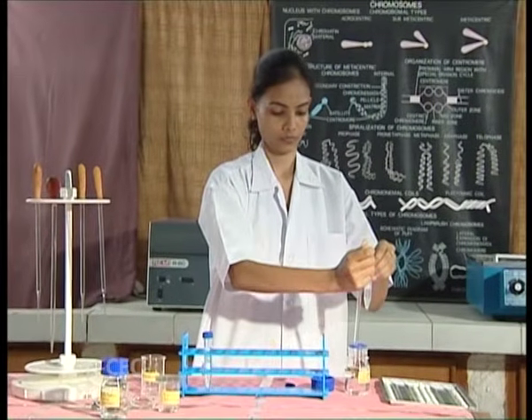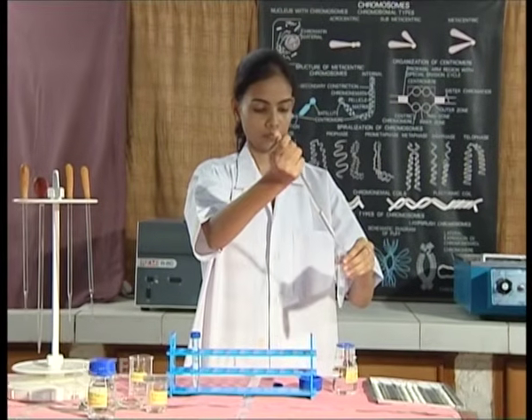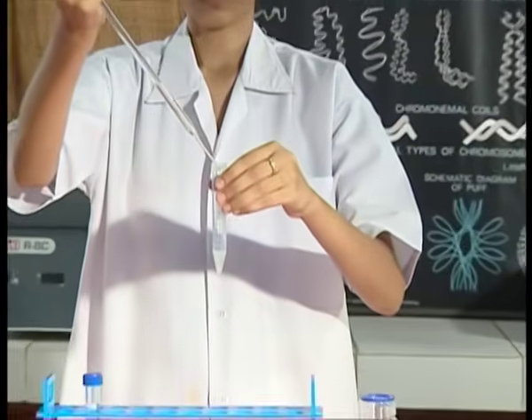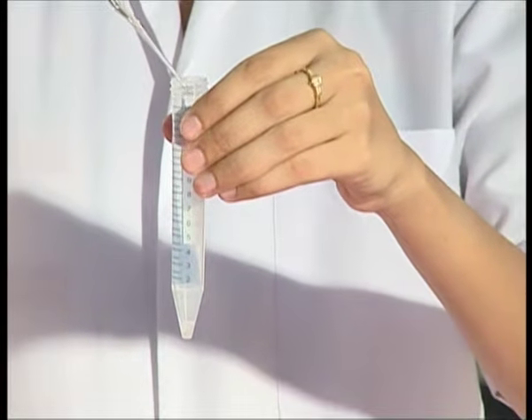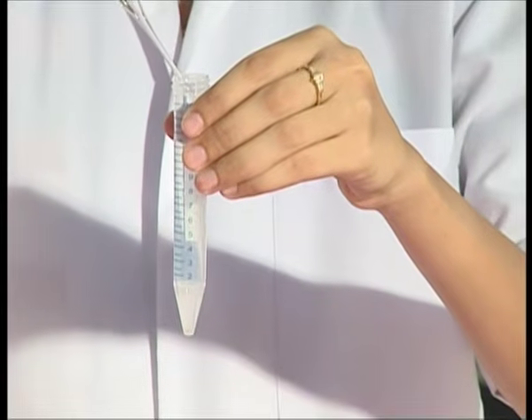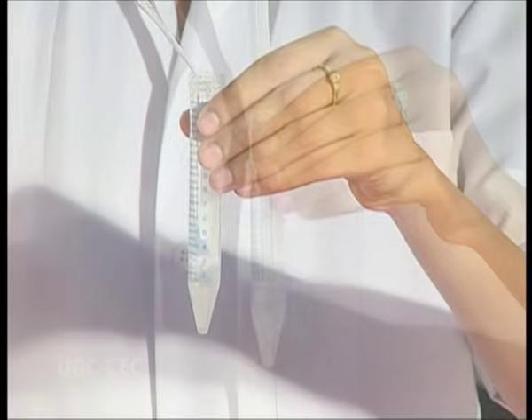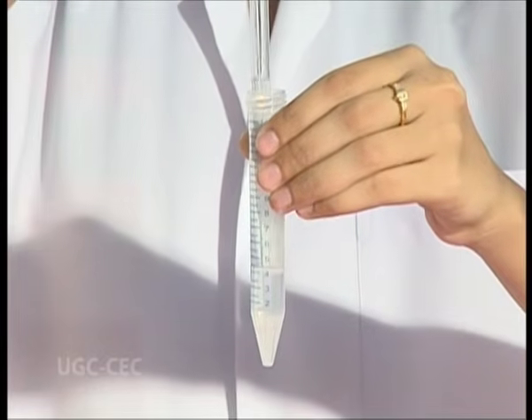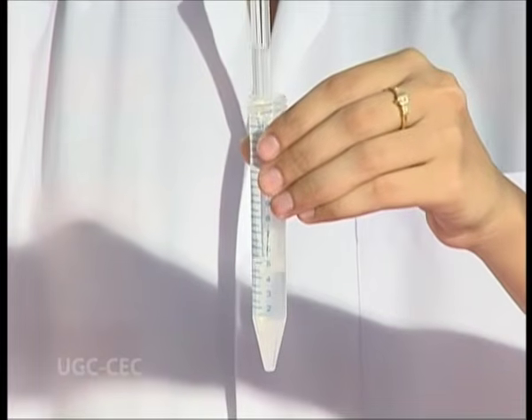Add 5 ml of hypotonic solution to the pellet. Now mix the hypotonic solution gently with the Pasteur pipette.